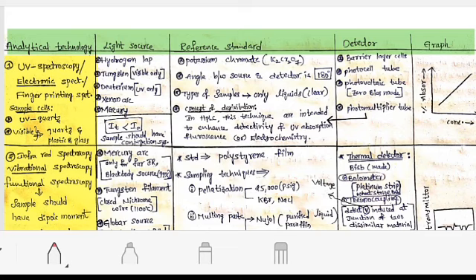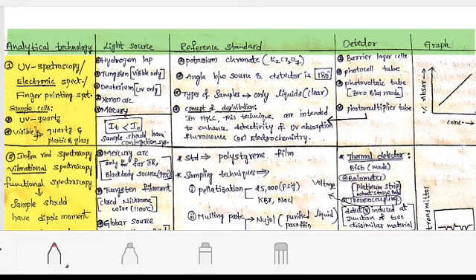The sample cells used in UV and visible light are different. For UV, you have to use quartz and should not use plastic or glass because they may absorb some light and give wrong reports. For visible light, you can use quartz, plastic, or glass.